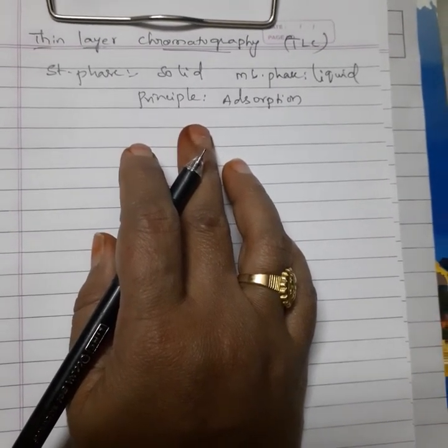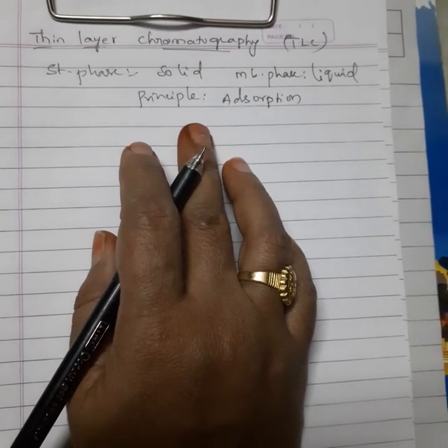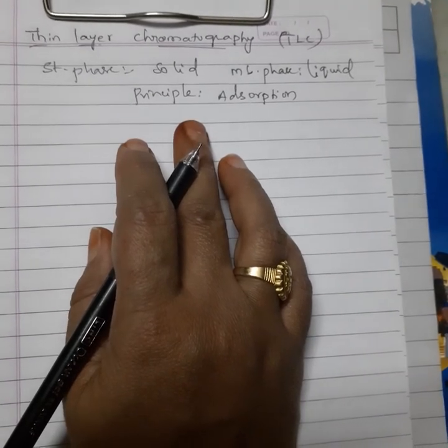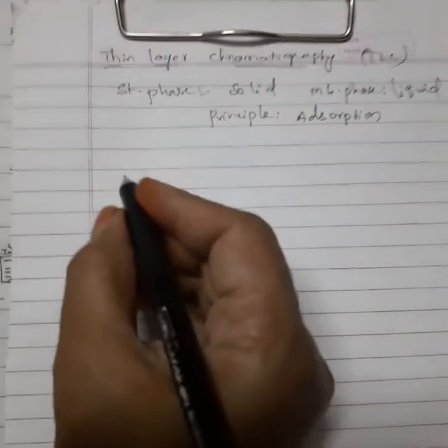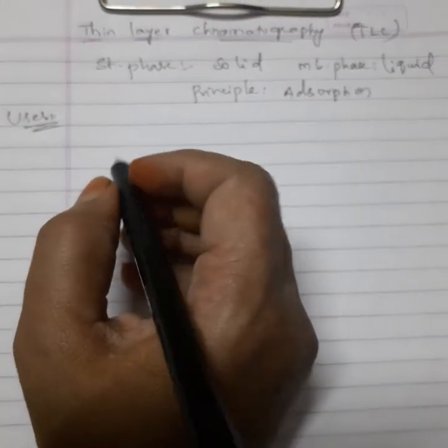Moreover, in column chromatography we need some time to do the experiment, but TLC will get finished within 5 minutes. Only a very short time is enough to get the values using this TLC. So that's why TLC is the most popular chromatographic technique, and laboratories use it highly in their labs. Now, what are the applications or uses of this TLC?